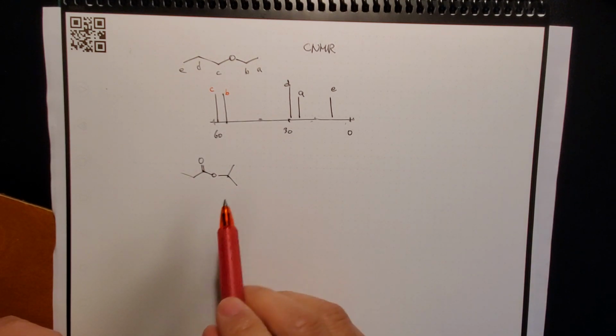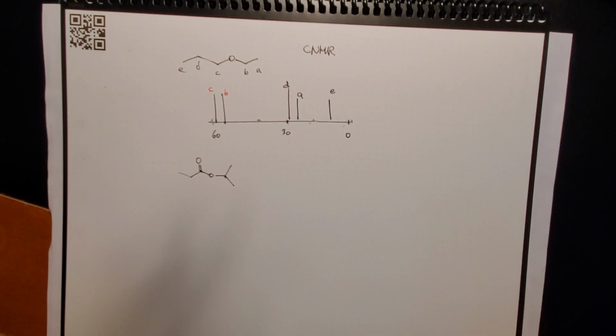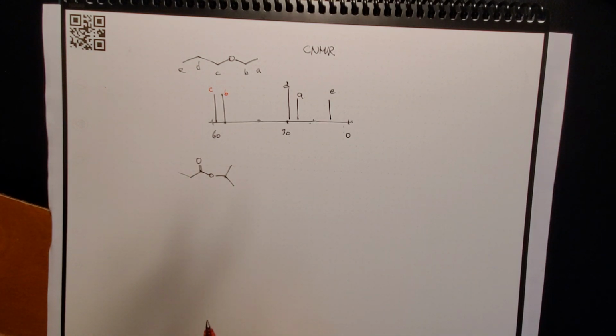By the way, this is the NMR of carbon-13 that's decoupled, okay? You decoupled hydrogen, so you get only one line for each carbon that is different. So how many signals on this compound do you expect for carbon-13?